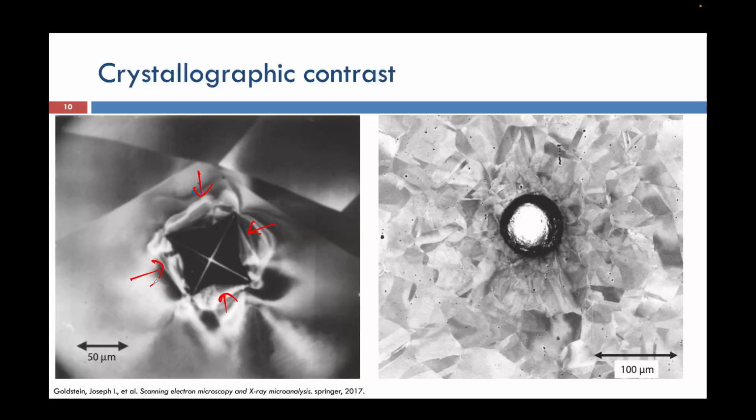This is a ductile material, I think nickel. So we will be able to see the plastic deformation, as well as the residual stress pattern in a ductile material.